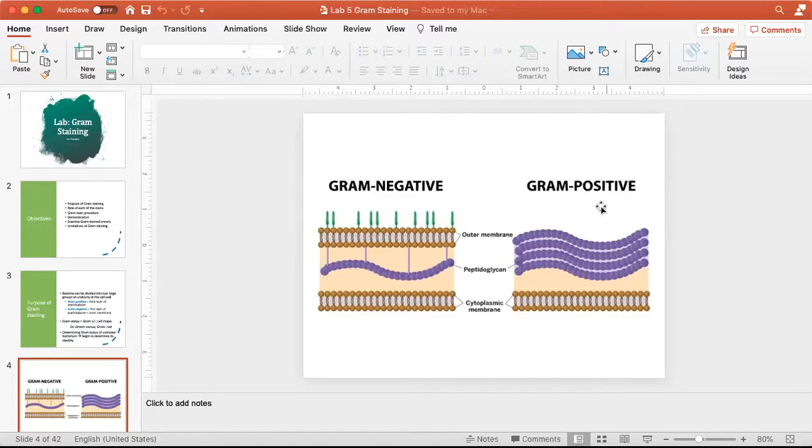So this is the outside area of the cell, and this would represent the inside area of the cell. This would be where the cytoplasm is, and the DNA and the ribosomes and so on. What's facing the outside of the world is this cell wall. And one of the things it does is it protects this cell from the dangers that might be out in the world. Nice thick layer of peptidoglycan.